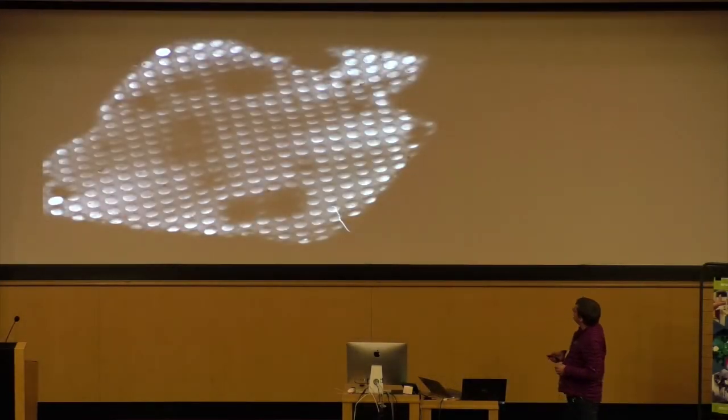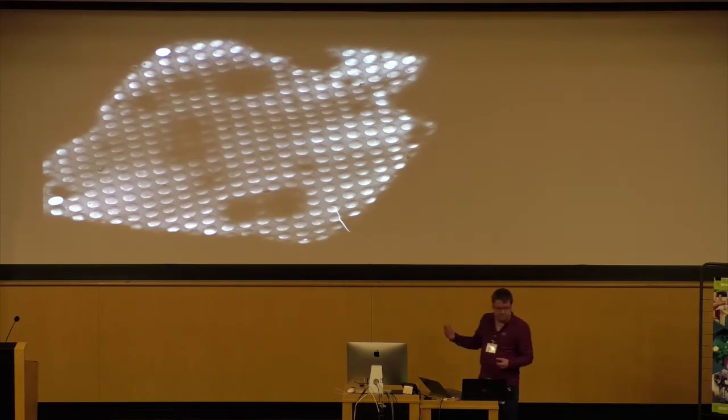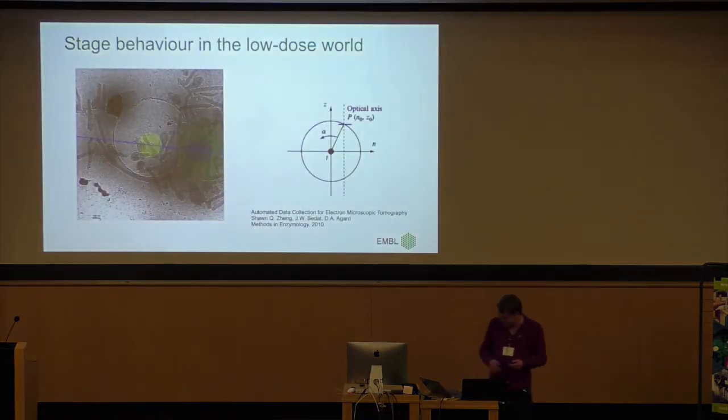When we take tomograms, we often assume, we hope to have a rigid body rotation because we assume the grid to be flat. But if you tilt to a high angle, most of these grids that we look at, just the carbon grids especially, they're everything but flat. We probably could have used molybdenum grids. It's a bit easier then because the molybdenum shrinks just as much as the carbon. But on the normal grids, it's just terrible. Gold grids are so far too thick anyway, because at high tilt you just can't get through anymore.